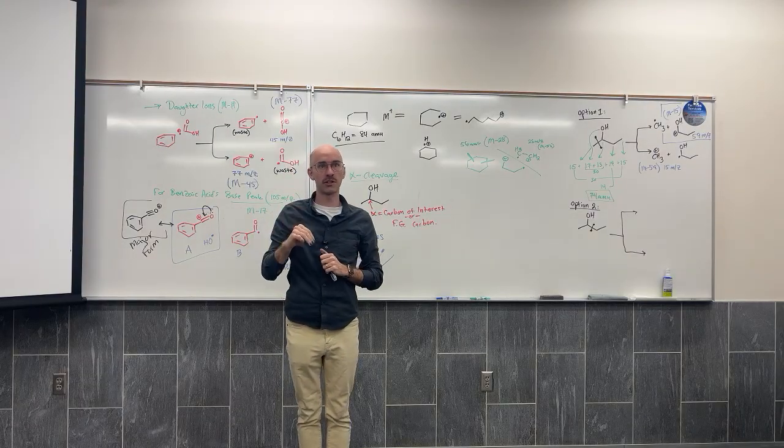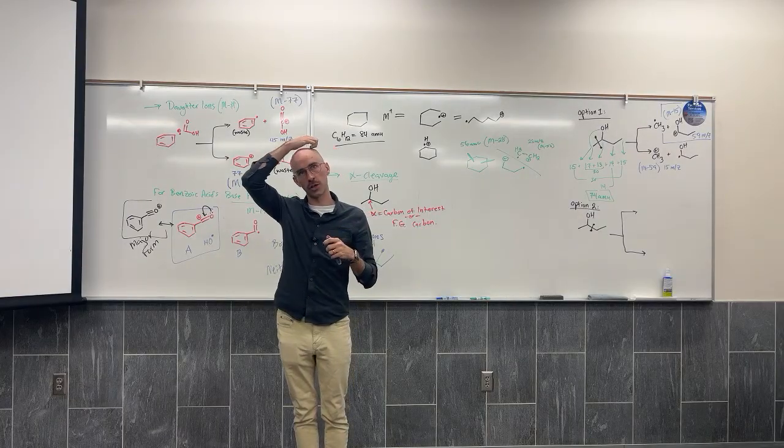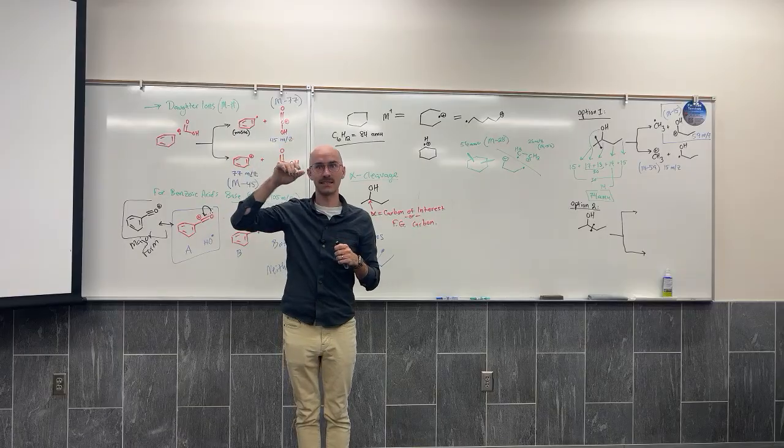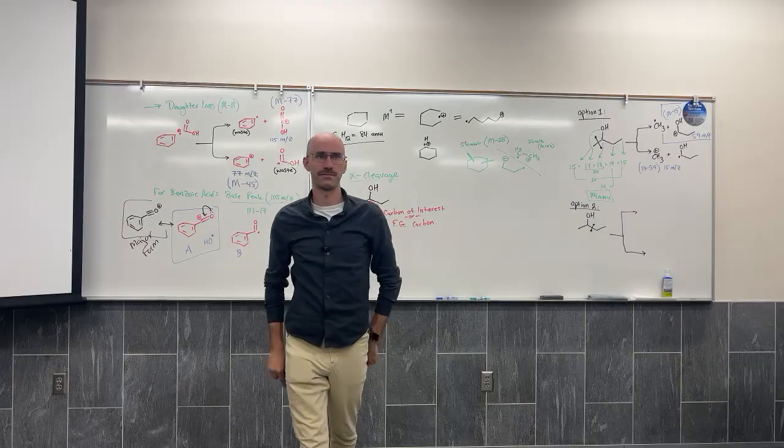The 3 structures we've looked at are all even massed. Most molecular structures are even mass molecules. Nitrogen makes them odd mass, so we can learn about nitrogen that way.